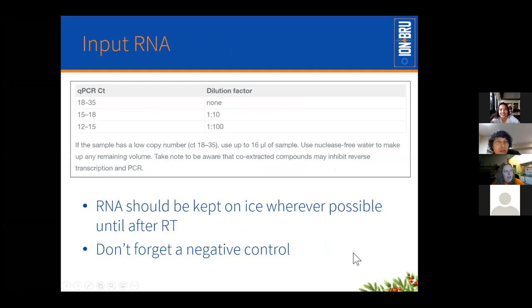So with your input RNA, again, I'll reiterate your RNA should be kept on ice. I'm sure most of you know this. And don't forget your negative controls. You should take a negative control right through the entire process.